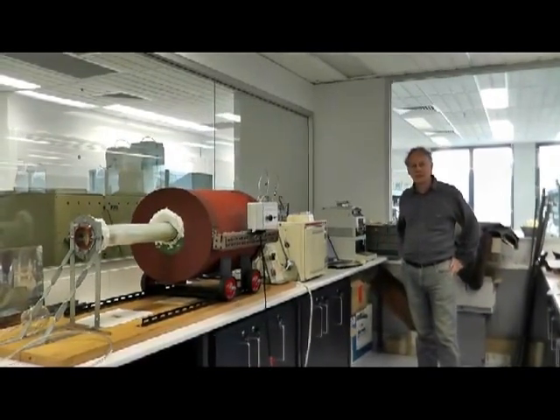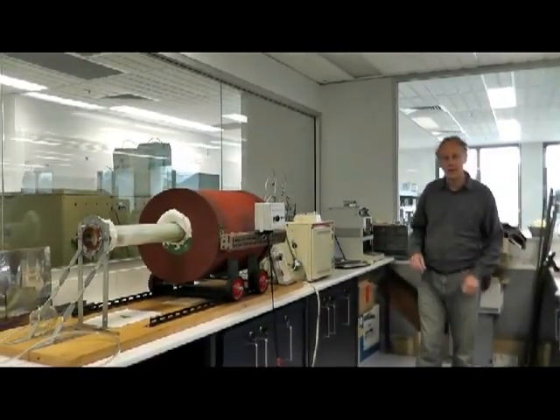Introducing the soil carbon bench, a facility to determine carbon from whole cores.